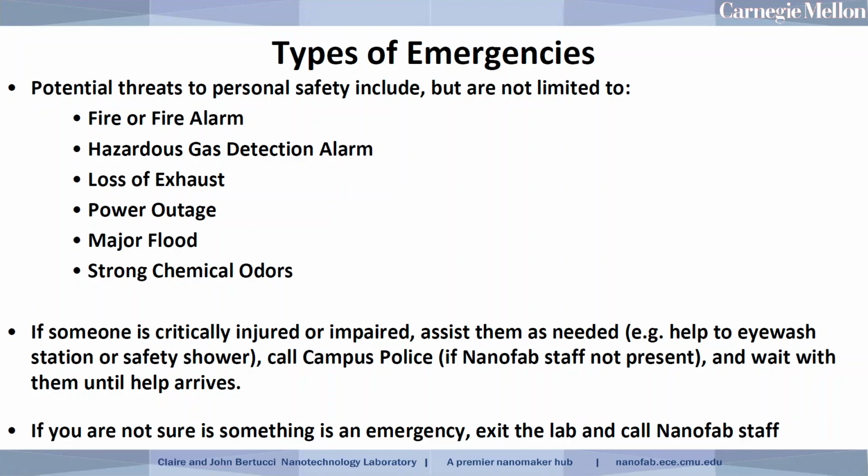So there's a little bit of judgment involved on this, and I realize that. But if you're ever in doubt about whether an odor is normal or would be a reason to evacuate the lab, it's always okay to err on the side of caution in that situation and simply remove yourself from the area until we can figure out what the smell might be.